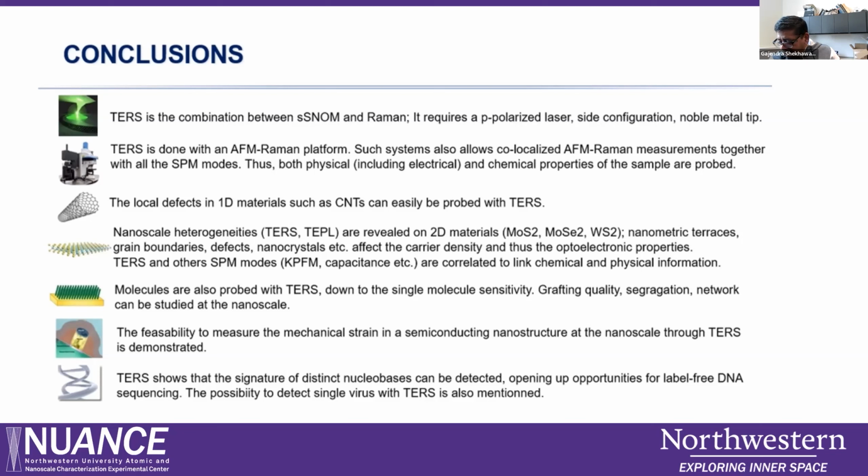I think the TERS probes they are making, they say that they have gone down to 8 nanometer, and the actual resolution is 4 nanometer, but there is also some convolution effect from the probe. So 3-4 nanometer with a step size of 1-2 nanometer, they have seen. And I'm hoping that we can see the defects at that low scale, but unless we do those measurements, we don't know. But the company still says that it's possible to measure those defects.